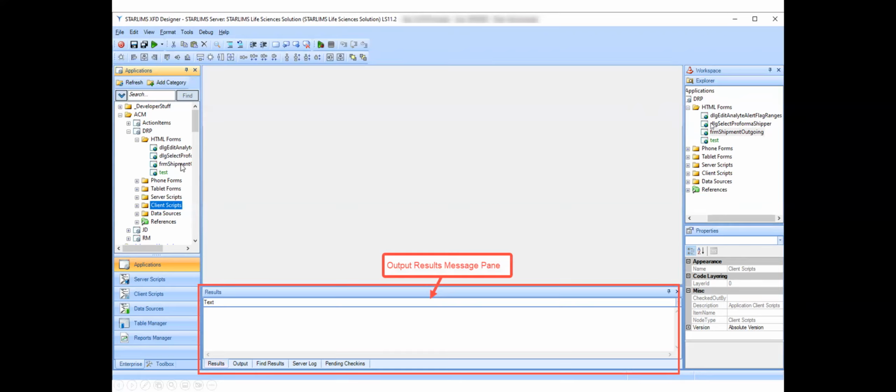So when you're in a form, you'll see that it appears green. You've got it checked out. That means it's checked out to you. And there's a check-in, check-out system, and we'll look at that in the designer later on when we do the live example. That prevents other folks from changing the code on you or modifying it in any sense. There is a code history that is associated with every single object that you create in the system, and you're able to go backwards and forwards in those iterations of the versions of those objects.